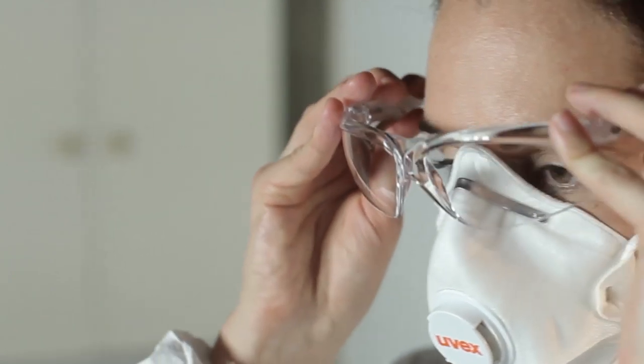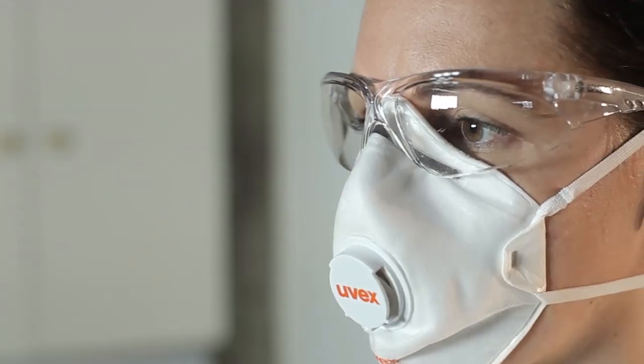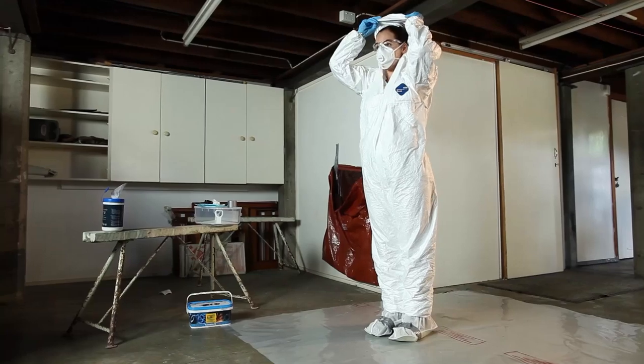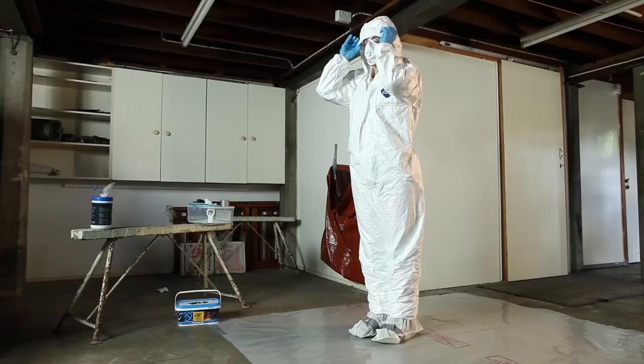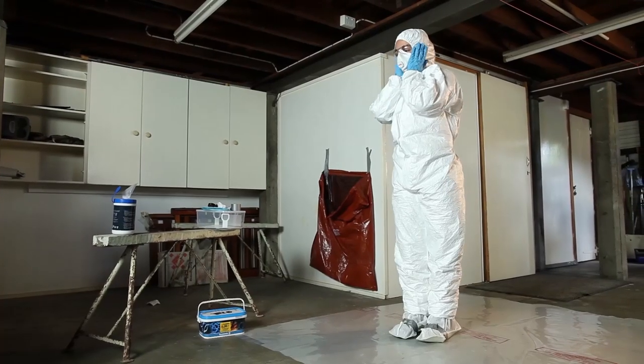There are a variety of face shields and eye protection options to choose from, depending on the task and the surrounding conditions. When putting on your eye or face protection, make sure there is no interference with your respirator straps. Next, put your gloves on. The last item of PPE to be put on is the hood of your coveralls. Place the hood over your head and secure it around your face and over the straps of the respirator, and zip it up. Now you're ready to start work.